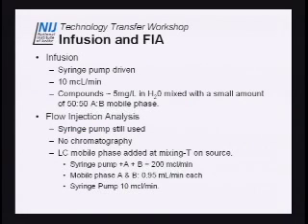Two things you're going to see a lot on this slide: infusion and FIA, or flow injection analysis. These are the things that I did when I made a lot of these slides. Infusion is just what you did for compound optimization. You load your sample into the syringe pump and you just inject it, and you tweak the source and record the data. The compounds were in 50-50 mobile phase, actually, it was mostly water.